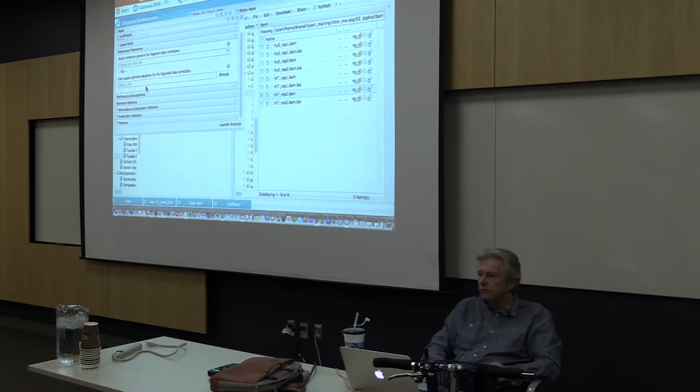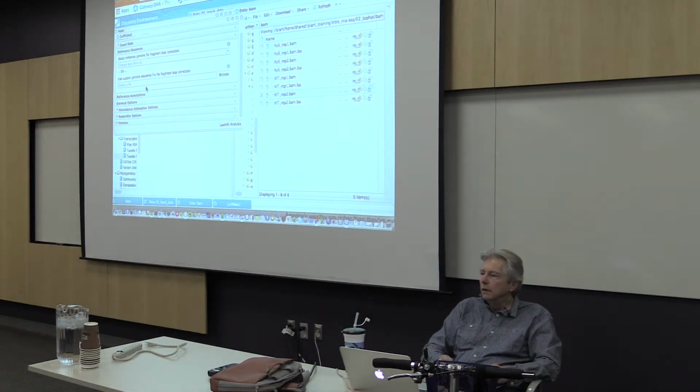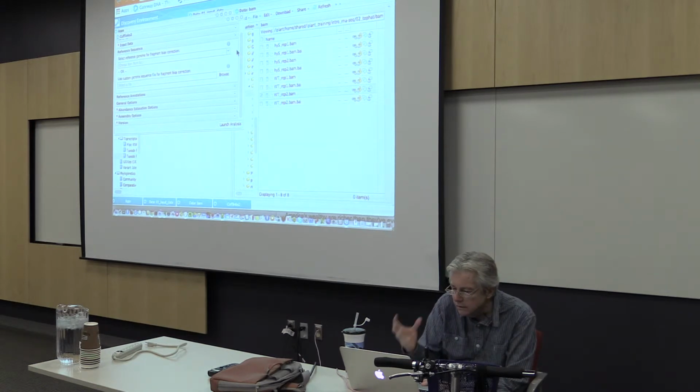From my understanding, fragment bias correction is essentially helping it decide where things actually map on the genome. It might take some time to remap some of the touchier areas where there are a lot of options for where related reads could map.